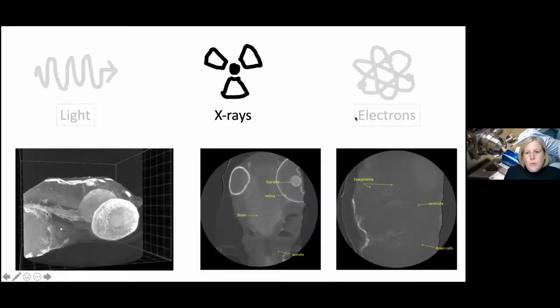So what was in my workflow, but I didn't really mention so far, is that we frequently drop an X-ray imaging step in the middle. If we go back to the zebrafish, you can see how amazing these X-ray images are. The sample turns 360 degrees in the path of the X-rays, and you take multiple images and then stitch them, reconstruct them into a volume.